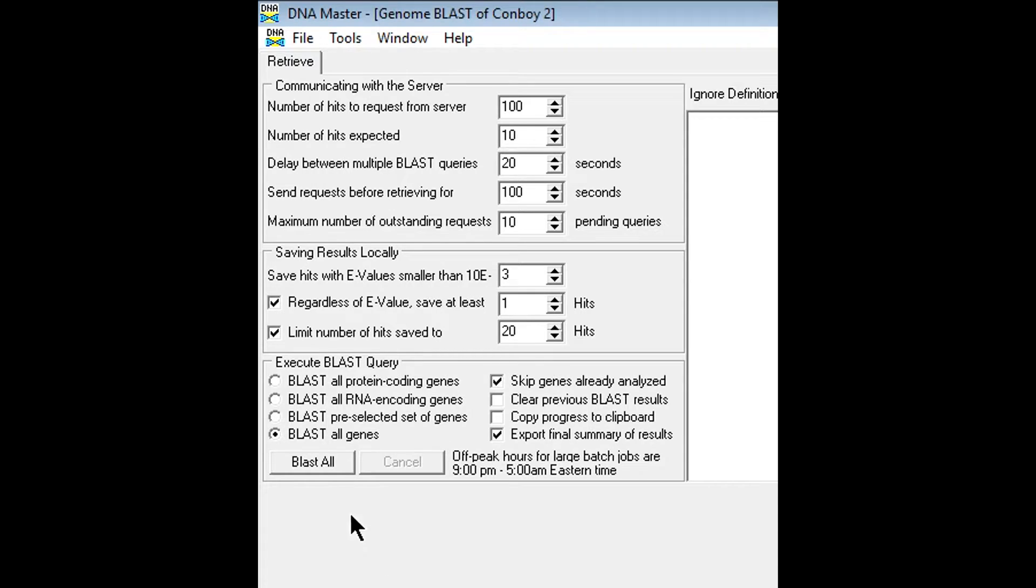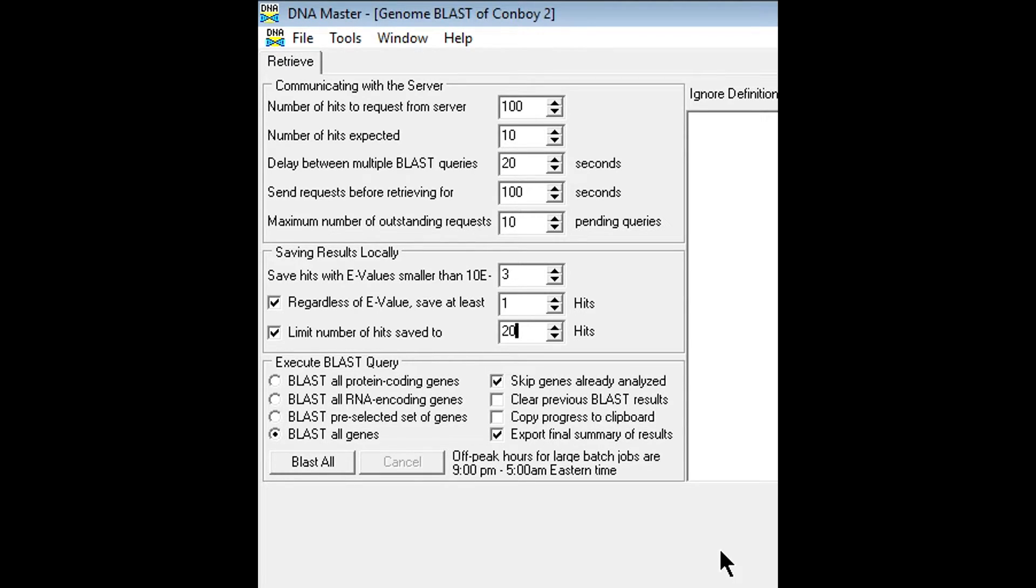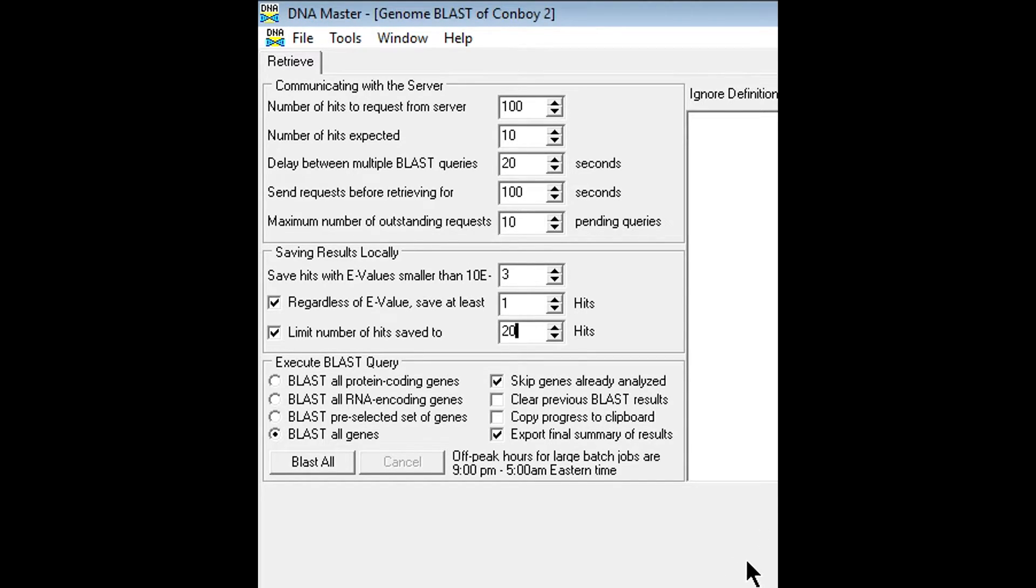When we hit blast all, it's going to send each gene or each gene's protein sequence to the NCBI server. The NCBI is going to search the database for things that are already stored with similar sequences. Once it does that, DNA master is going to retrieve those results and bring them back here into the DNA master program.